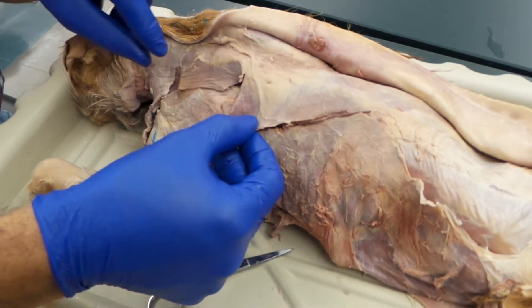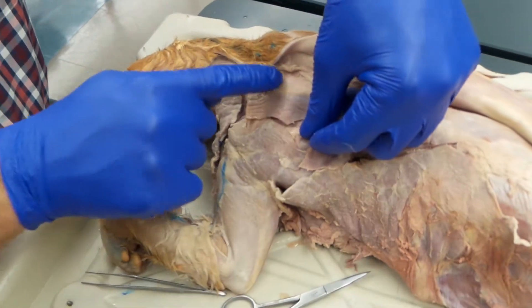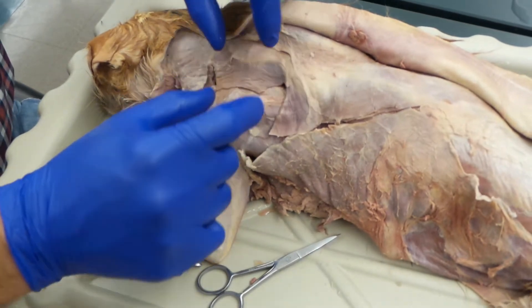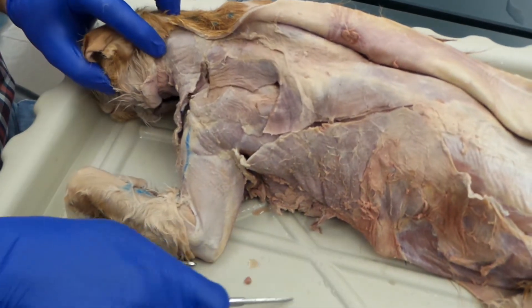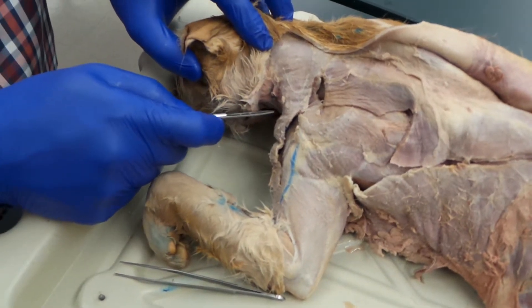In cats, there are three separate muscles. In humans, it's one fused trapezius. The next right here is kind of a blocky muscle — it has a piece kind of cut out of it. That is the acromiotrapezius. And then running right up here on the neck is the clavotrapezius.